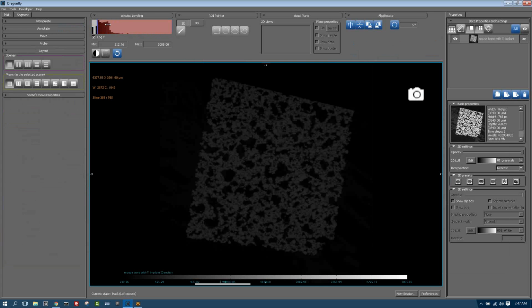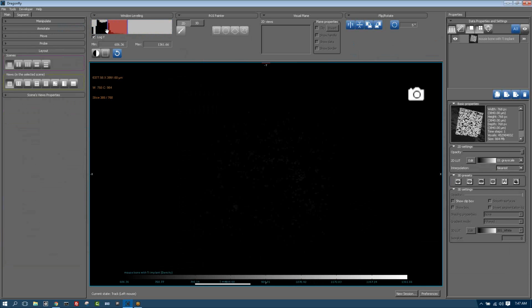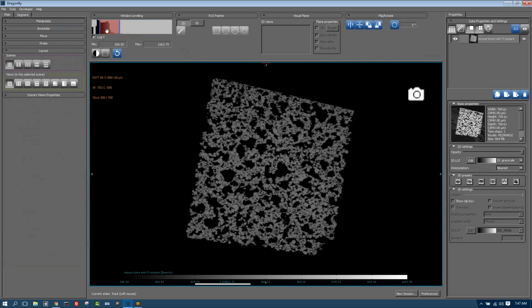and that'll be just fine. So what you can do on these histograms is you can map the intensity. So what I have is over here, you can see a grayscale color map. The grayscale color map is saying that everything on this edge of the histogram will be mapped as black, everything on this edge of the histogram will be mapped as white, everything on the interval will be some sort of gray, everything to the right of this is white, everything to the left of this is black. So you're able to see exactly how you're mapping that intensity space.